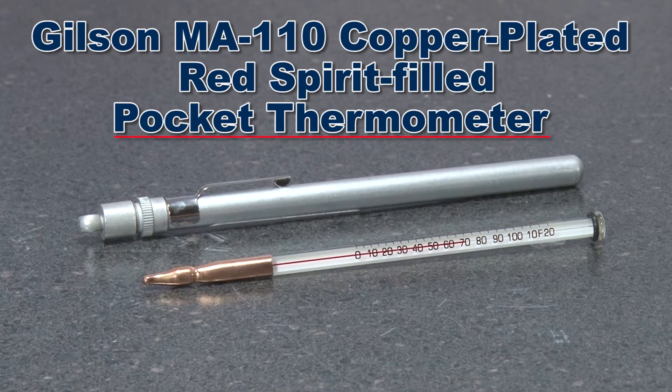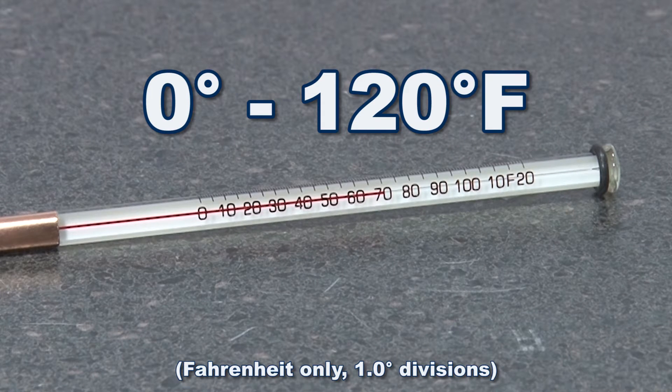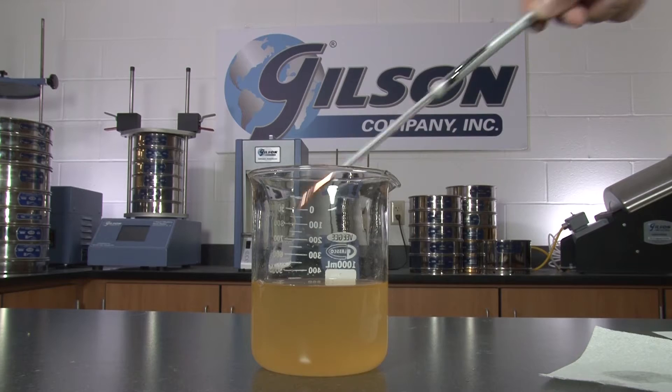Gilson also offers the MA110 copper plated red spirit filled pocket thermometer with a temperature range of 0 to 120 degrees Fahrenheit. The pointed copper bulb prevents abrasion and breakage, and the reversible aluminum storage case serves as a handle.